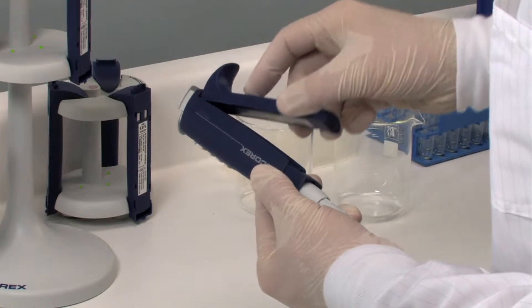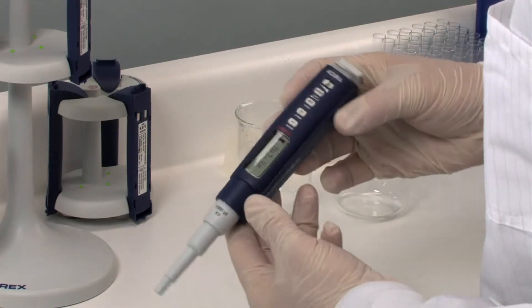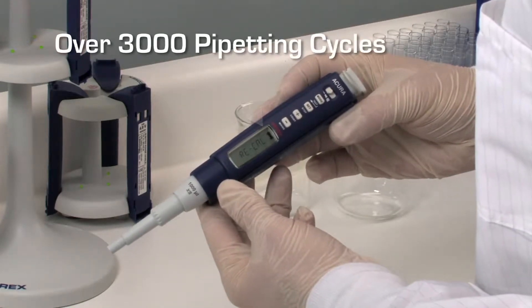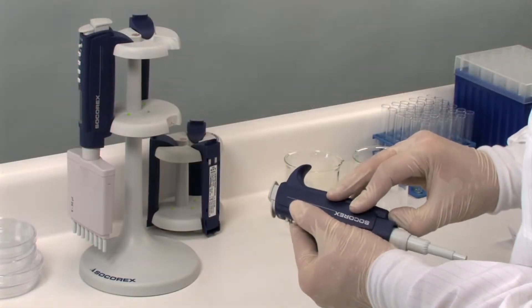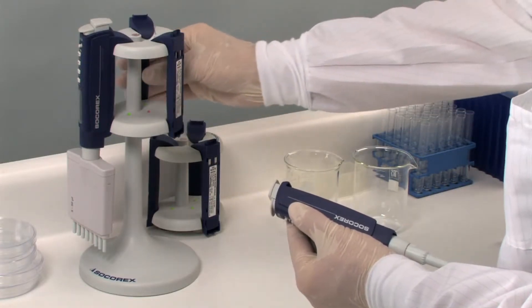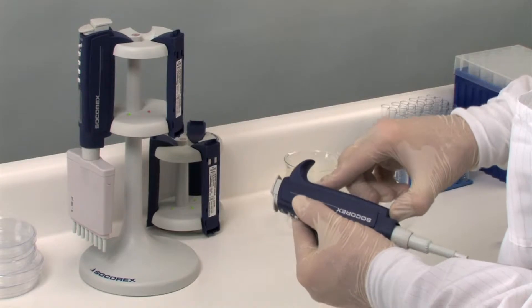The energy source is a rechargeable nickel metal hydride battery. The charging level is indicated on the display. A fully charged battery enables over 3,000 pipetting cycles. Full charging takes about 90 minutes. The battery can be charged while on the pipette or separately on the charging stand. A charged battery is inserted very quickly and easily.